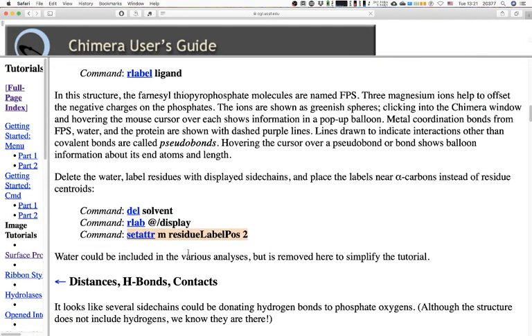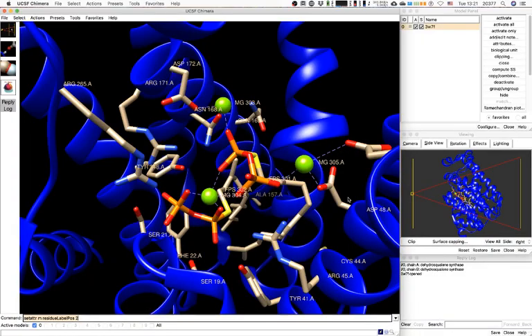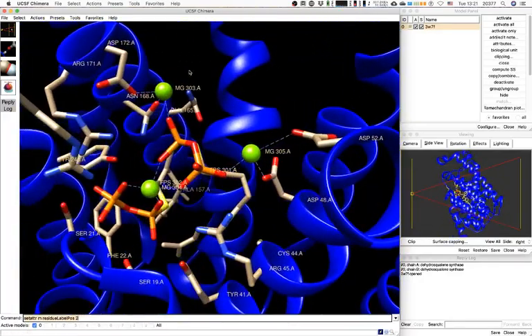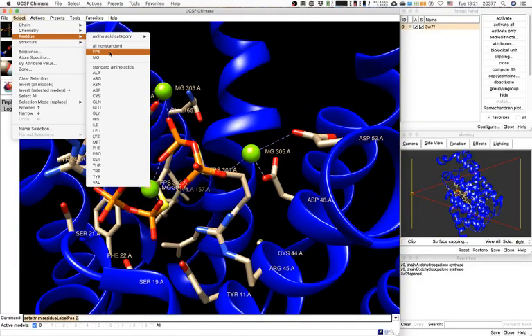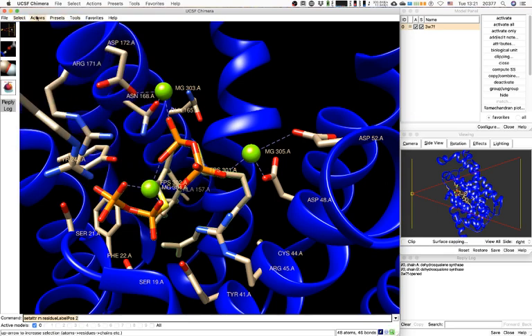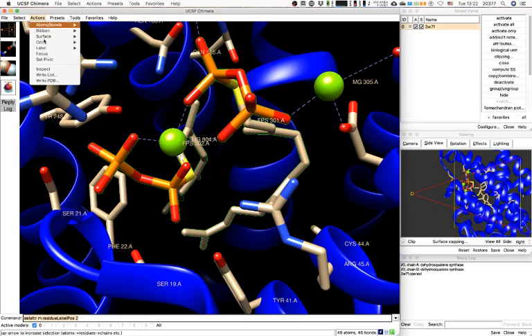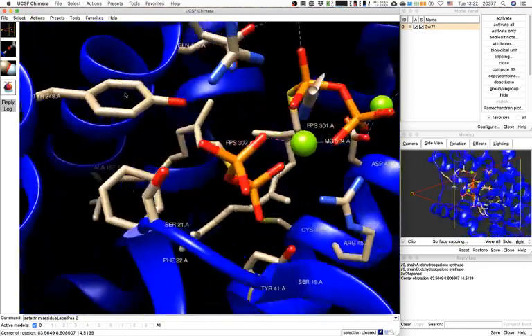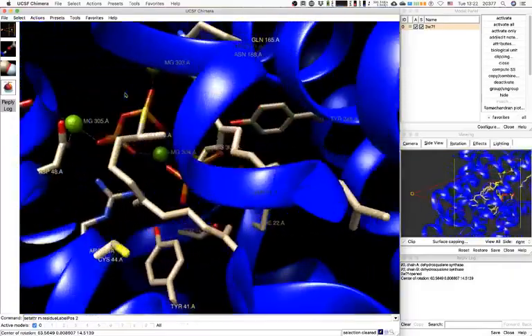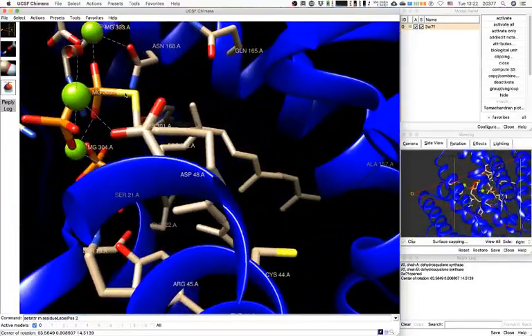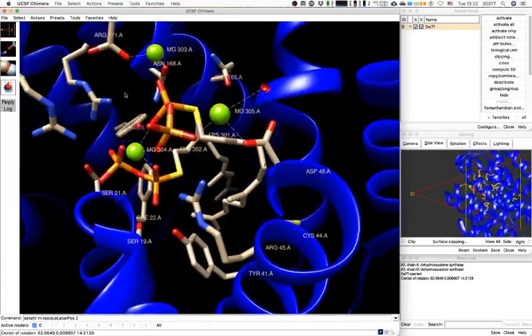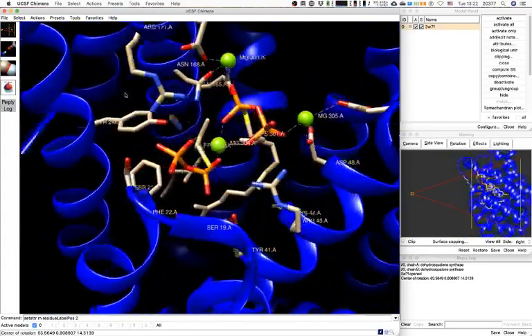Water could be included in analysis, but here it's been removed to make the tutorial simpler. I can select the FPS molecules, focus to them, or set them as the pivot so that if we rotate the molecule that will be the center of rotation. This lets us take a peek at other orientations of the active site and get a good idea of what's going on with the interactions.